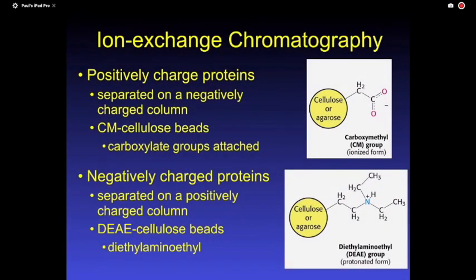And you can buy all sorts of beads, some that have a partial charge, like a carboxy group. That's considered a weak ion exchange. Or you can get ones that are positively charged all the time, a strong ion exchange. And so you look these up and you can buy a whole host of these from different suppliers.